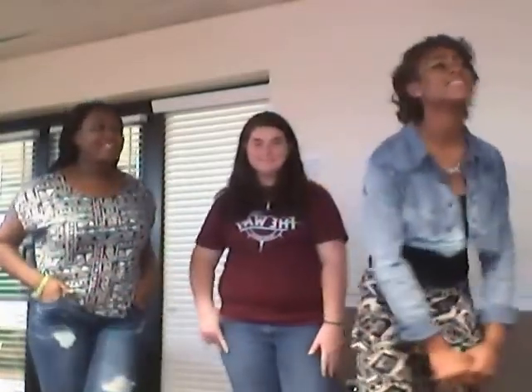Oh, hi there! I'm Tanika, and we are doing a video about experiment 3, on how to calculate the empirical formula of a compound. This is done using the law of definite proportions, which states that mole ratios of elements in a compound will be small whole numbers.